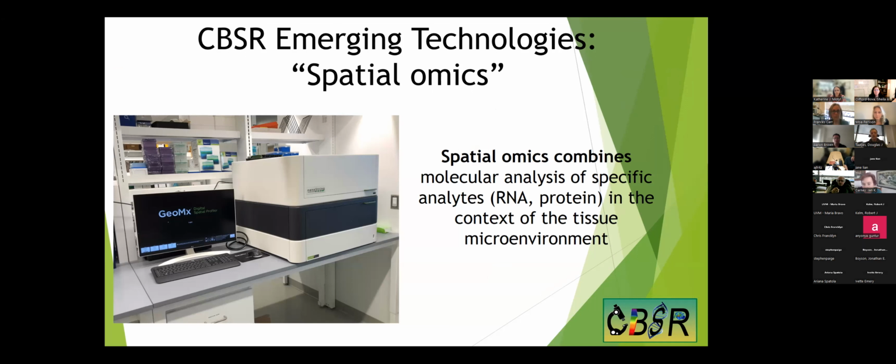This is, I think, an exciting time for us here at UVM and working together with our colleagues in Maine. And I thank Fran for the introduction on the Center for Biomedical Shared Resources. The introduction of the center came at a really opportune time for us, because the technologies I'm going to speak about today are in the realm of spatial omics. Spatial omics is one of the newer omics terms that has come to the forefront in science in the past few years. We can really think of it as the ability to combine the molecular analysis of specific cellular analytes such as RNA and protein in the actual context of the tissue microenvironment.